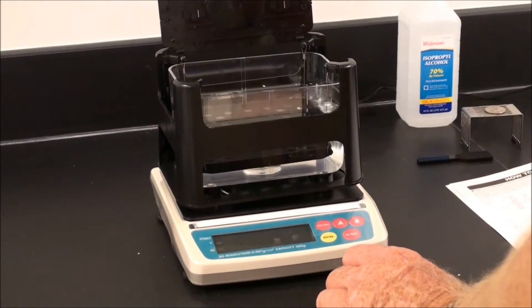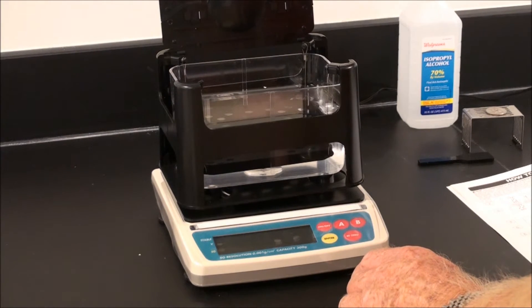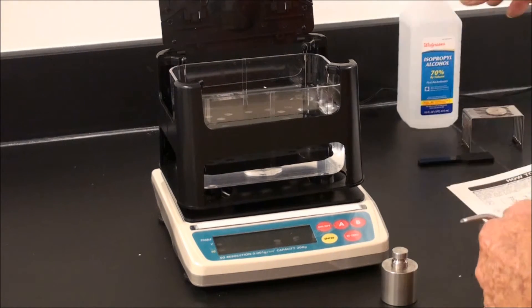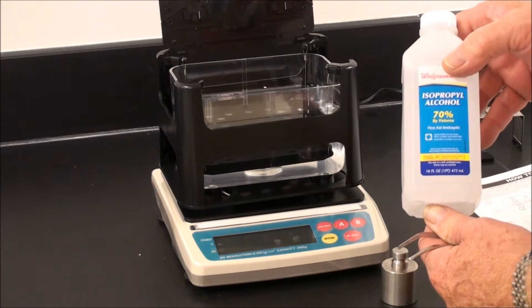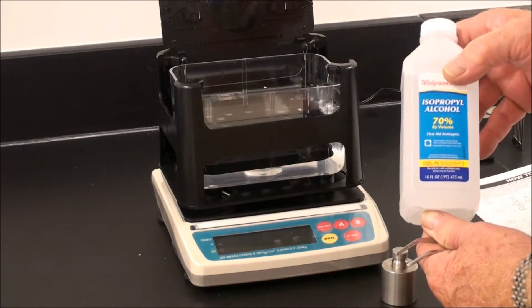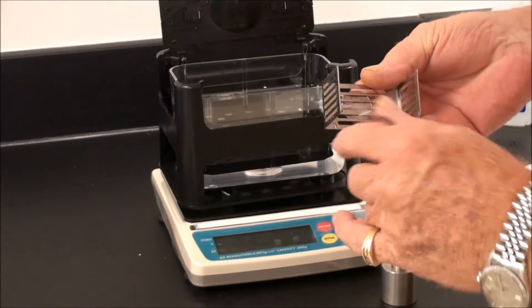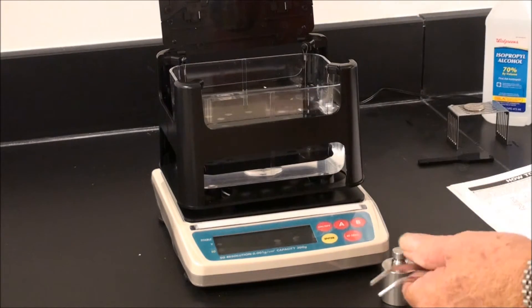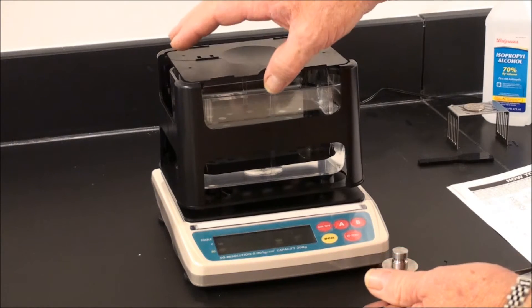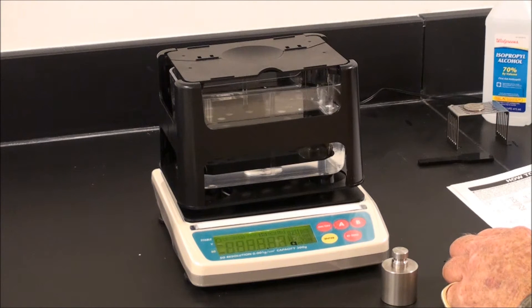To perform a calibration, it's very easy. Fill the tank with water, and we suggest adding a few milliliters of isopropanol or ethanol. This helps prevent formation of bubbles underneath the weighing stage and the samples, which results in unwanted buoyancy. Close the stage, turn the power on, and allow the system to stabilize.